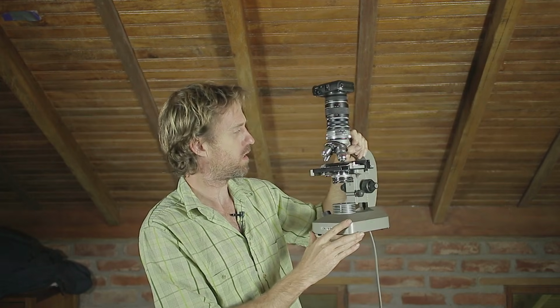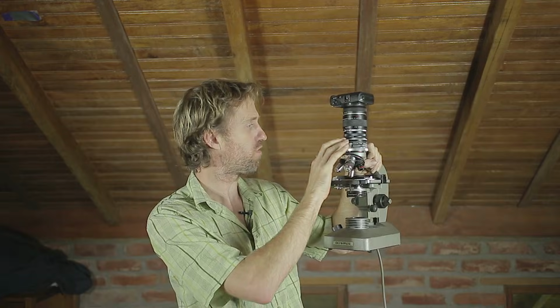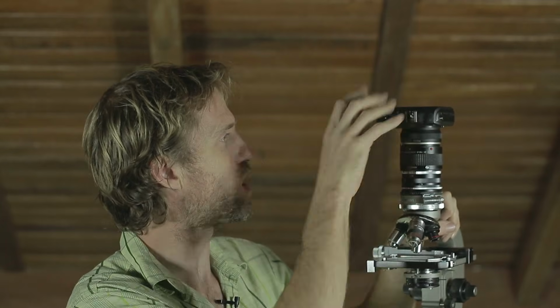This is the microscope that we're going to use. It's an Olympus KHS. It's quite old, but it's still got some really great glass here in these objectives. And I've modified it so I can attach my digital camera on the top here. For starters, let's see if you can guess what this one is. This is using the microscope with a 40 times objective and almost the maximum magnification that I can do without using a special oil lens.